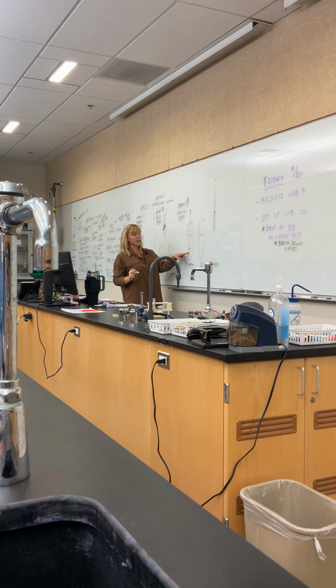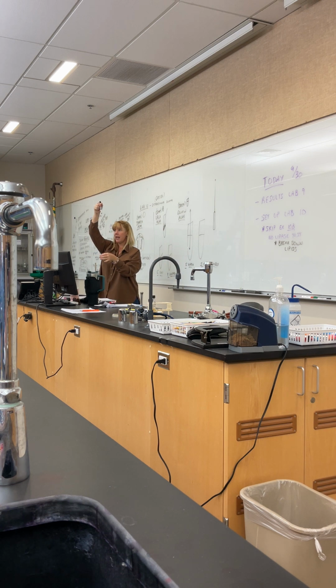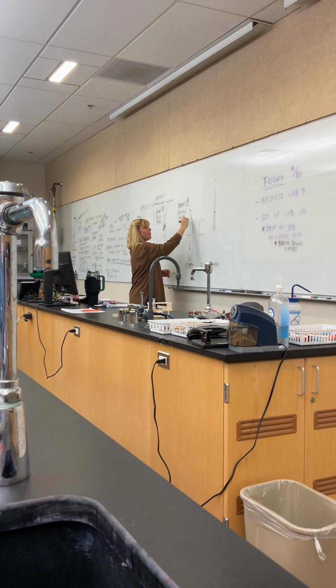Not all the way to the bottom, but about 3/4 of the way down, so I have a little gap at the bottom. So I stab and I lift. And then I stab and I lift, and then I stab and I lift. And I'm gonna keep doing stabs and lifts in different areas.